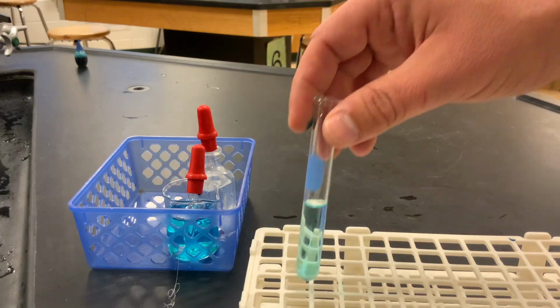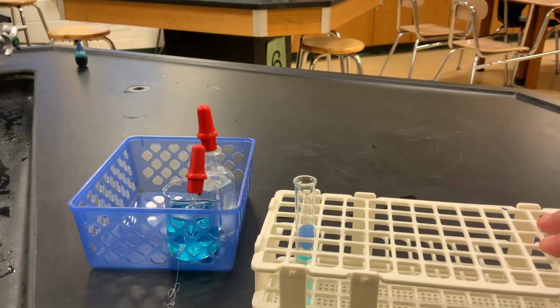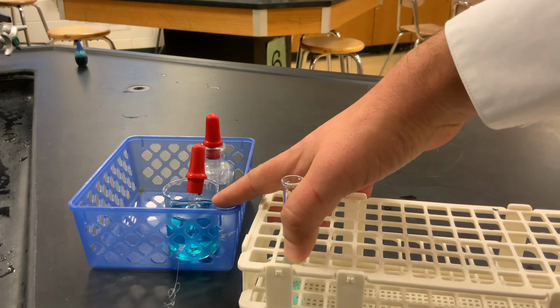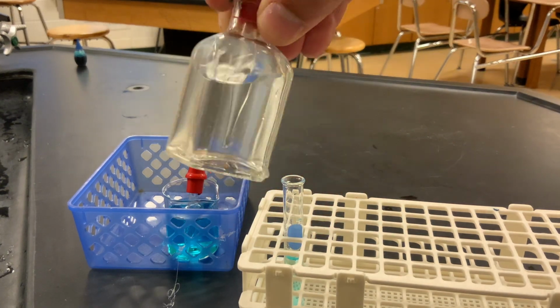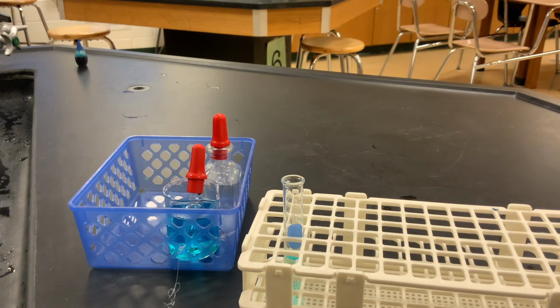So you'll test once, then you'll do your next test and just follow that same process. It's a pretty straightforward lab, but you've got to pay very close attention to whether something is mixing or not mixing, and be very careful not to cross-contaminate with your dropper bottles and with your beakers, because some of the substances will be in these small beakers, some of them will be in these dropper bottles, but everything will be labeled. They're not right now because I don't want to spoil anything for the lab, but that's what you'll be able to use for this lab.